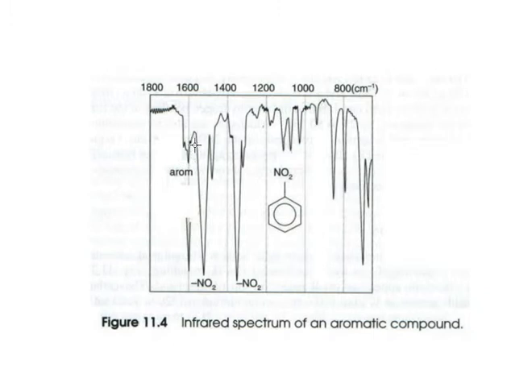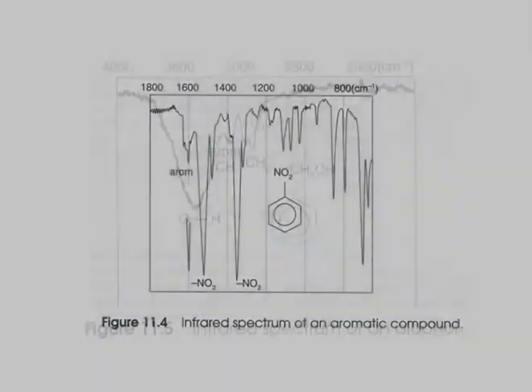This peak here is at 1600, and there is a peak here which is 1500, although I don't see a 1450. So the peaks here are associated with the aromatic CC bond stretching motion. The next spectrum.